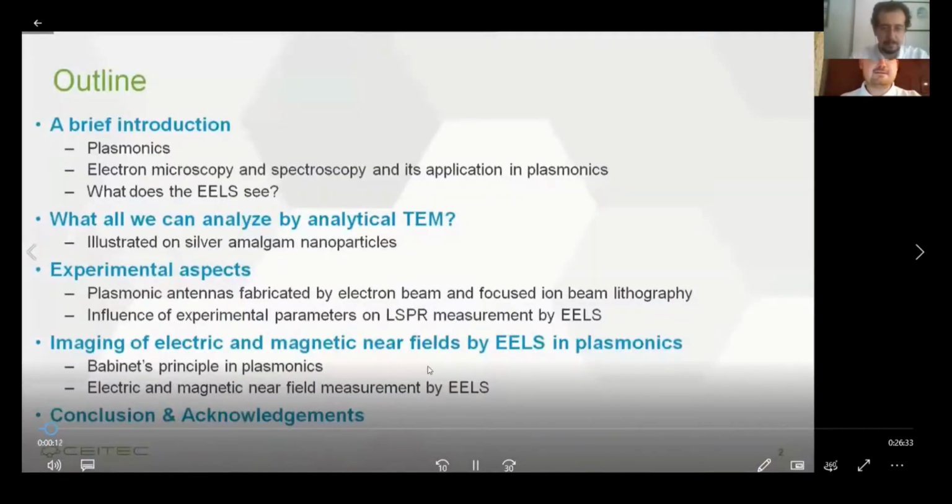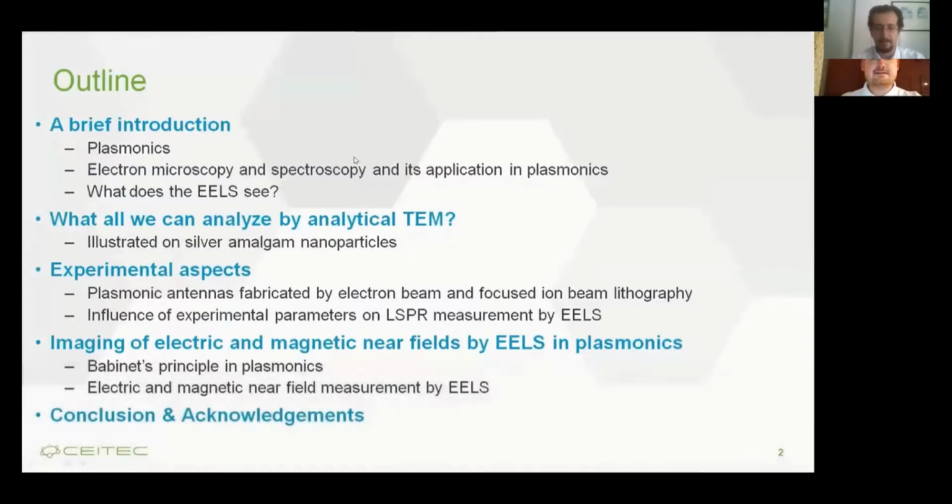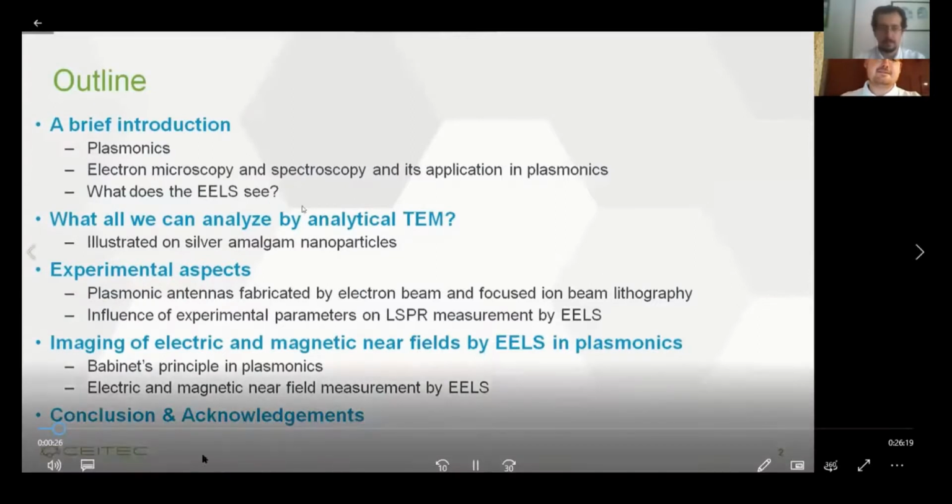I will start with a brief introduction where I introduce to you plasmonics, electron microscopy and spectroscopy and its application in plasmonics, and I will tell you what the electron energy loss spectroscopy sees.